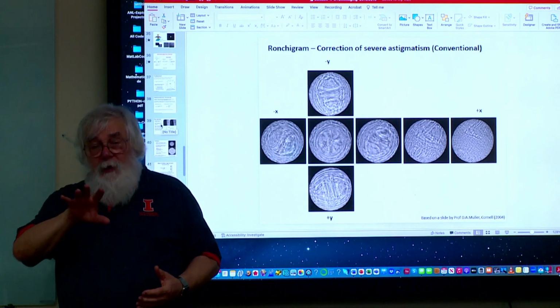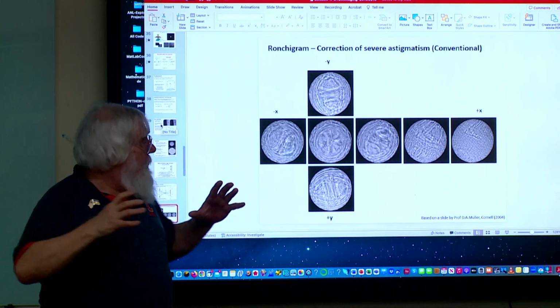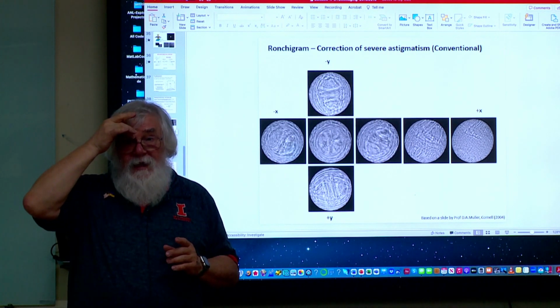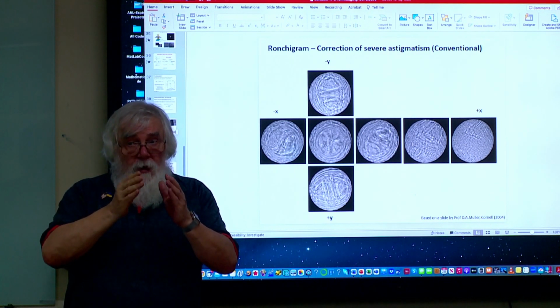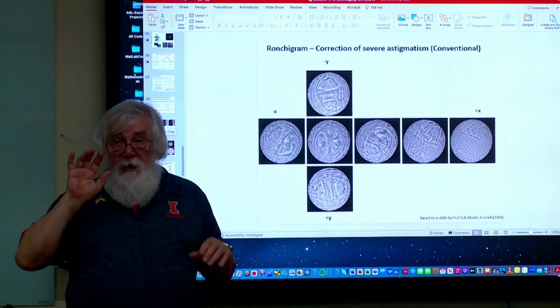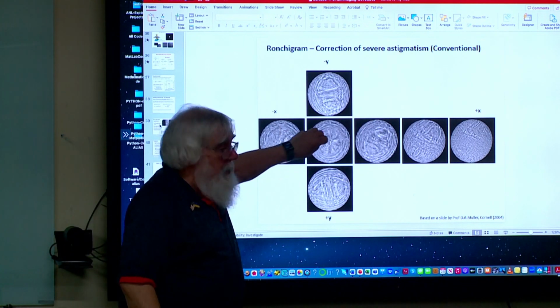You'll go to the point that's called infinite magnification. The only way to show you that, I probably should add some slides like that. You'll have to learn on your sample how to go to infinite magnification. And you'll see the image zoom in and zoom out as we go in and out here.